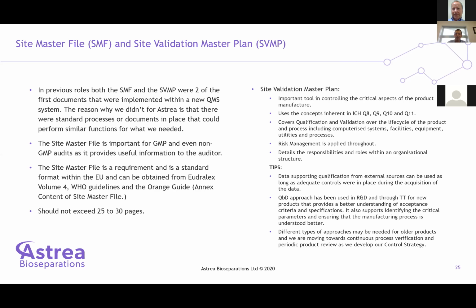We're also introducing, and again, part of the control strategy that we're going to talk about, the life cycle of the product. So recently, in the last year or so, we've started to do periodic product reviews. And the MHRA guidance, again, this is something very typical to what we had within GMP. Within the MHRA guidance, it says annual product review.